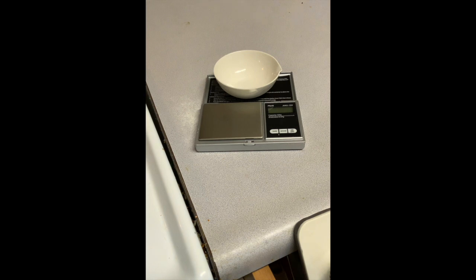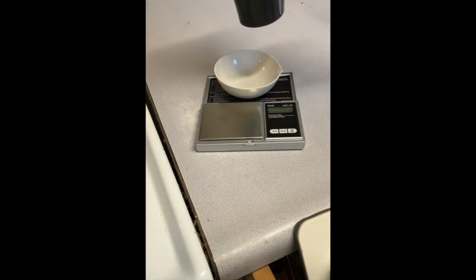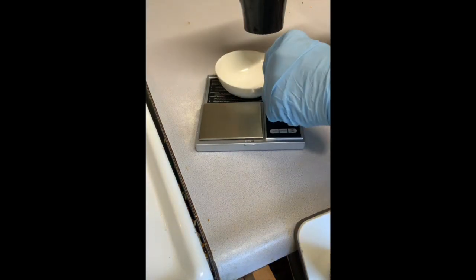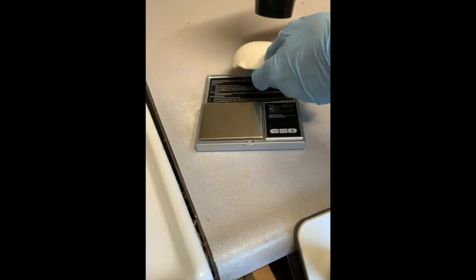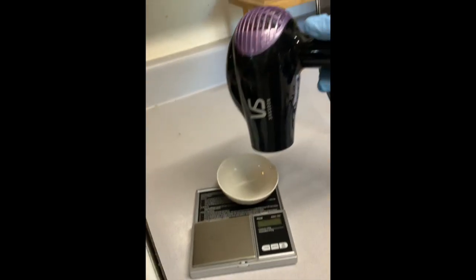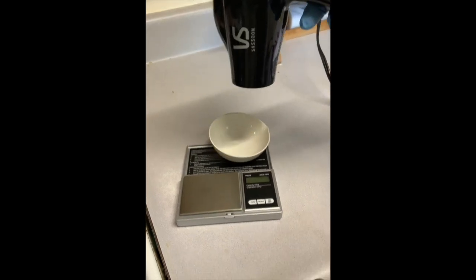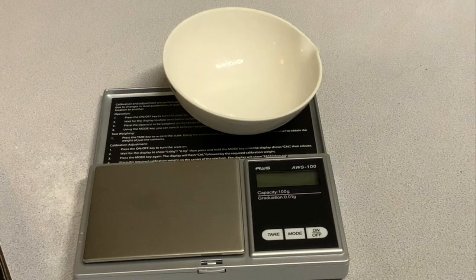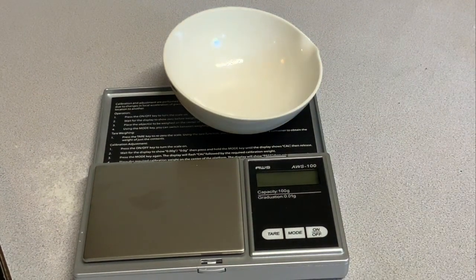To ensure that the evaporating dish is totally dry, I'm just going to take a hair dryer and make sure that the evaporating dish is totally dry.